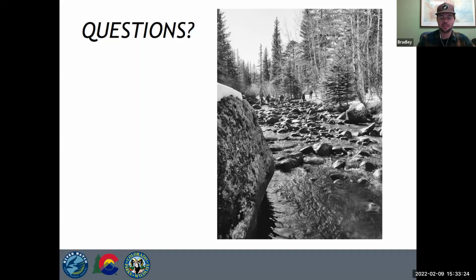I don't know what a small piece of feather is called, but I had a couple questions. I thought you explained it really well, but are there any downsides to switching over to this new ICP? It seems to be more accurate. Maybe we have all this historical data using the same technology. Would that be a downside of switching? Is it going to change anything going forward?